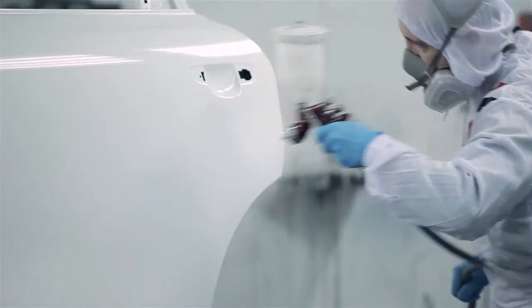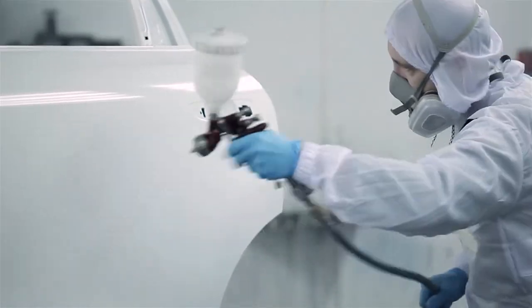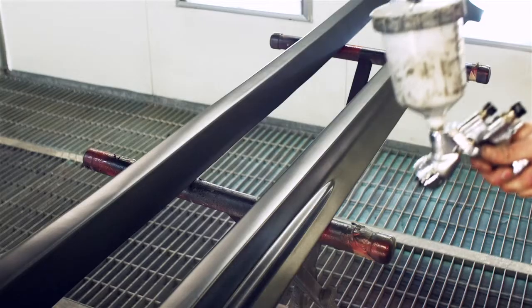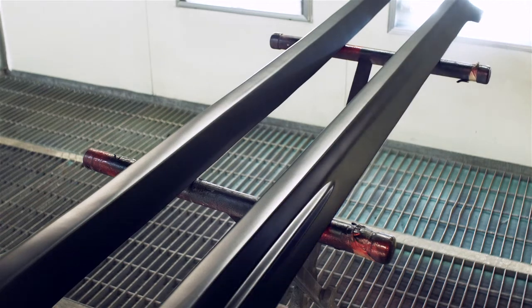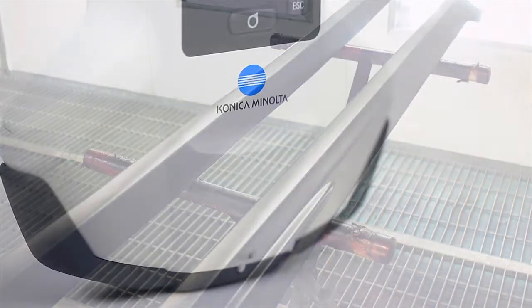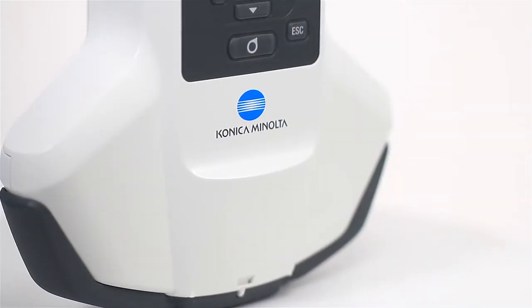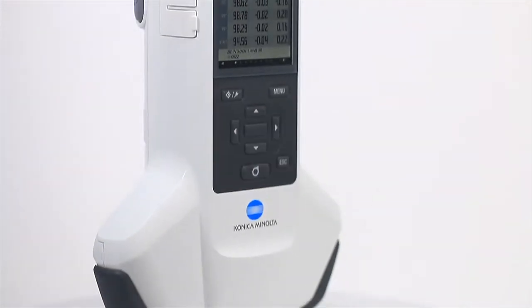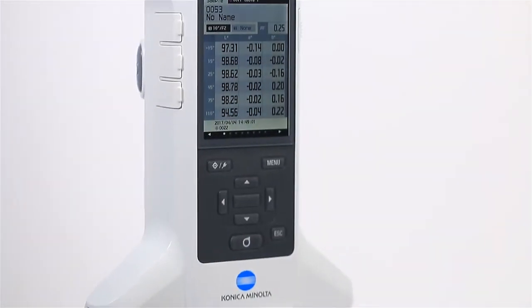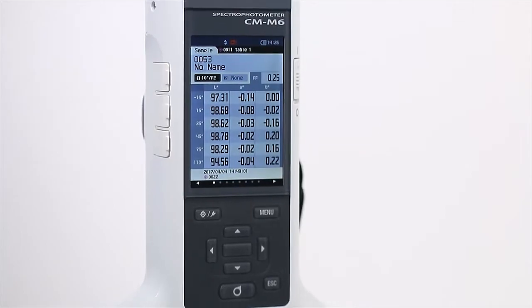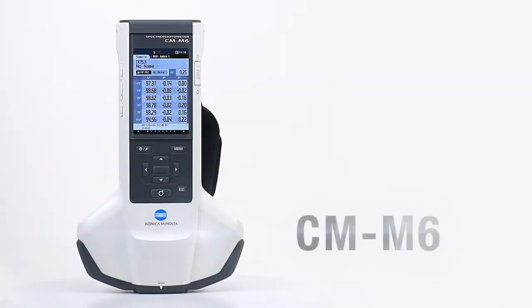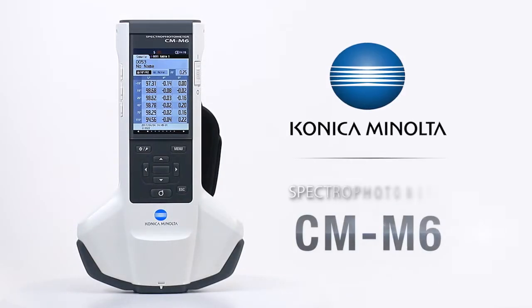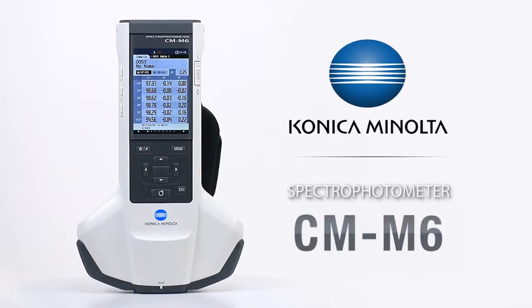As the color of paints and coatings become more complex, it is important that brightness and other color-related standards remain consistent. With this in mind, Konica Minolta Sensing designed the handheld spectrophotometer CMM6.